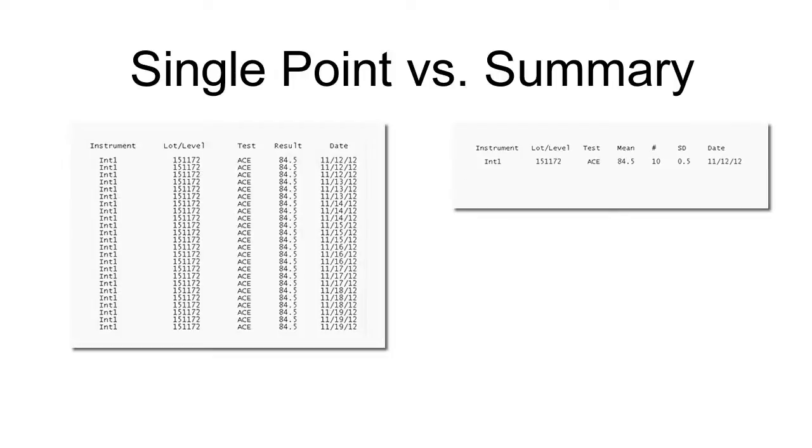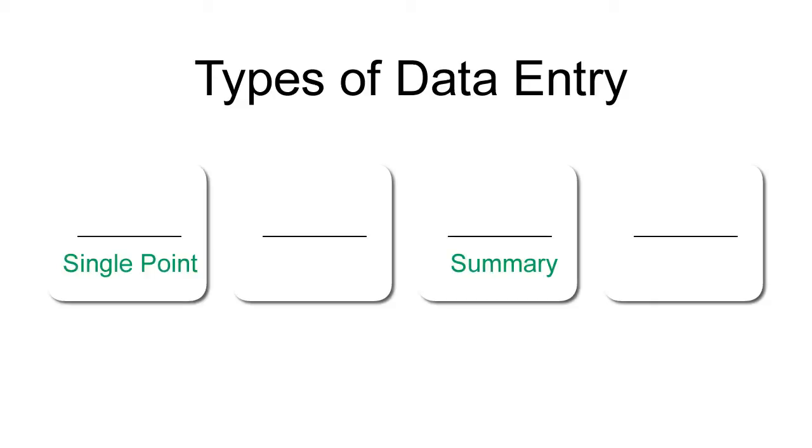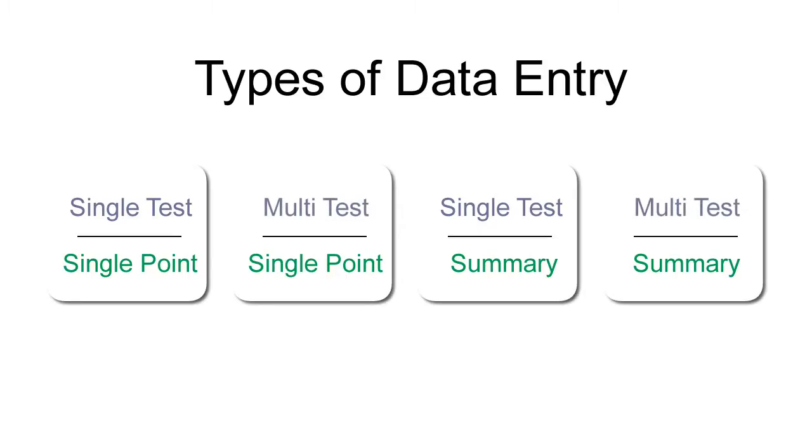With this in mind, let's compare the options for data entry so you can determine what works best for you. There are four types of data entry. As we learned, you can enter single point or summary data. Our first type of data entry allows you to enter single point data for a single test, or you can enter summary data for a single test. Some customers prefer a faster method. This allows you to enter single point or summary data for multiple tests at the same time.